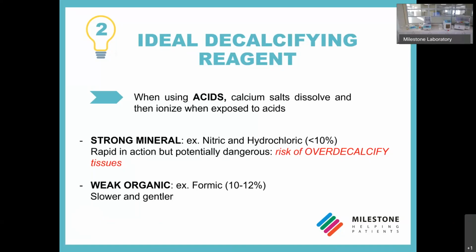They are rapid in action, but potentially dangerous, because if they are used for excessive time, they can cause loss of nuclear staining and macerate your tissues. If you use this type of reagent, you need to be very careful. There is a risk to over-decalcify the tissue.